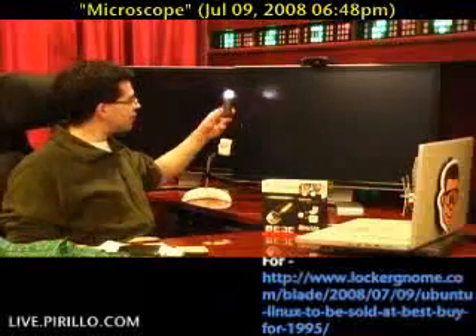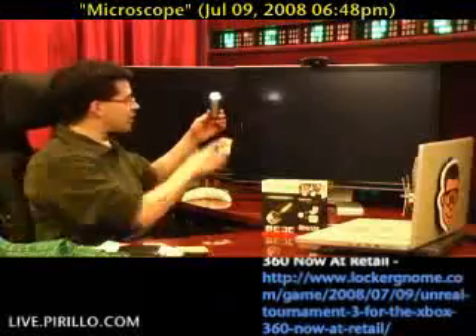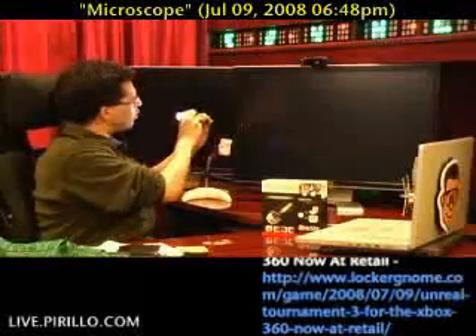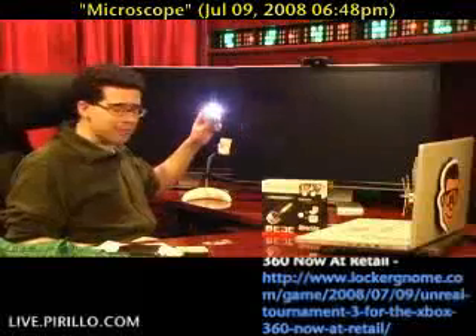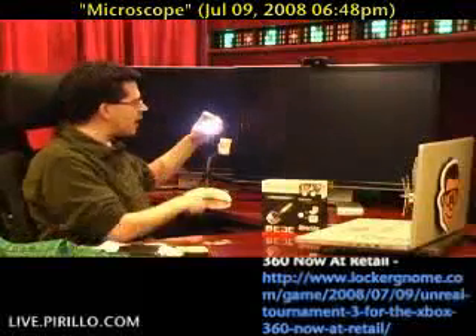This is the size of it — it's not even the size of a bulky cigar. Half a cigar, really. It's like the length of a finger, and the circumference of about a quarter. So it's not that big at all. Very lightweight. You can see the LED lights inside, which can be toggled on and off.